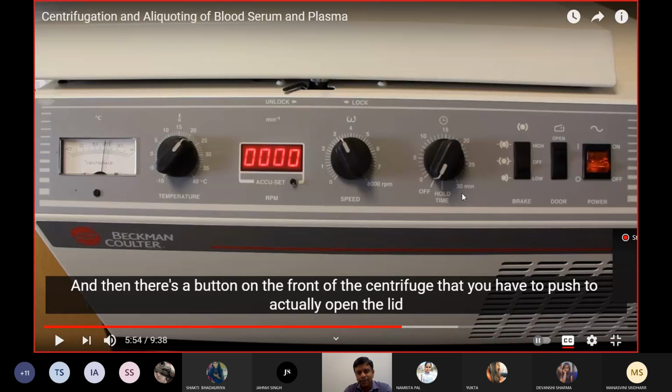But there are high-end centrifuges, like this one, which can maintain temperature for you. It can also do the time, right? So if you just set it at 10 minutes, it will end after 10 minutes. So you can set the time and you can set the RPM.